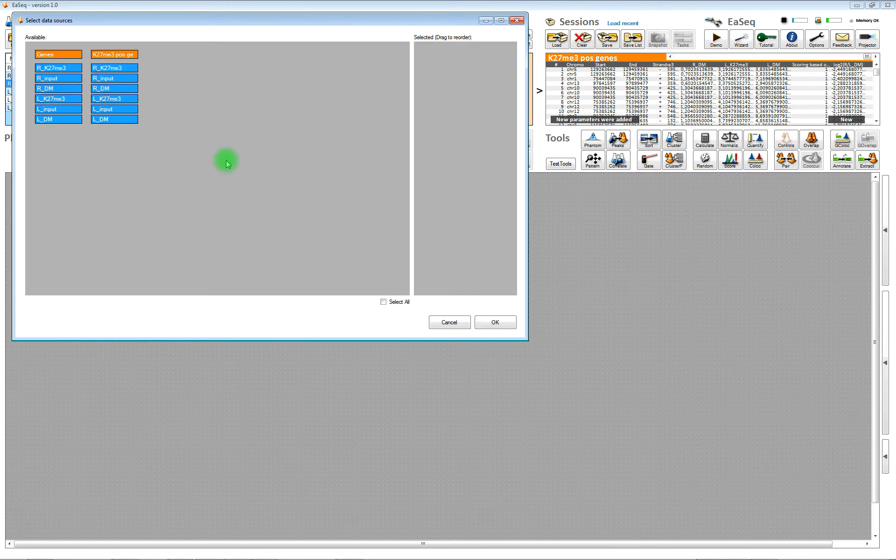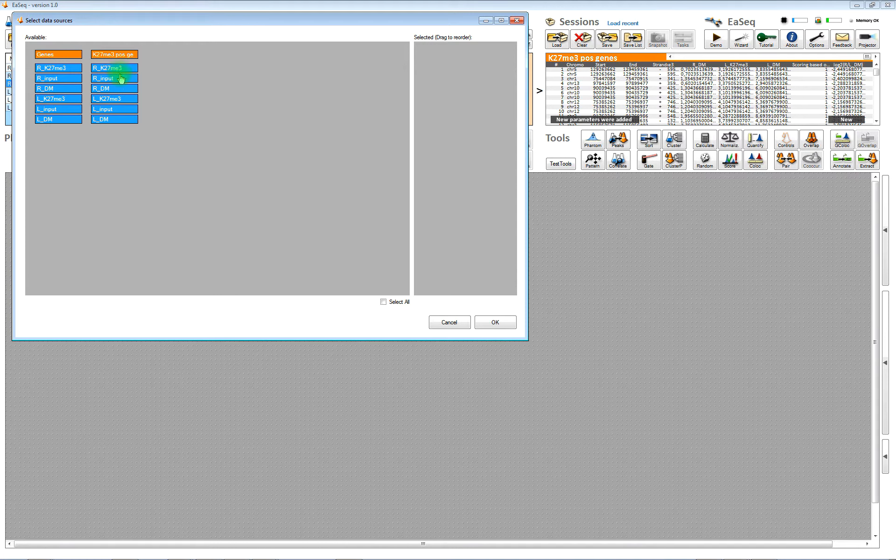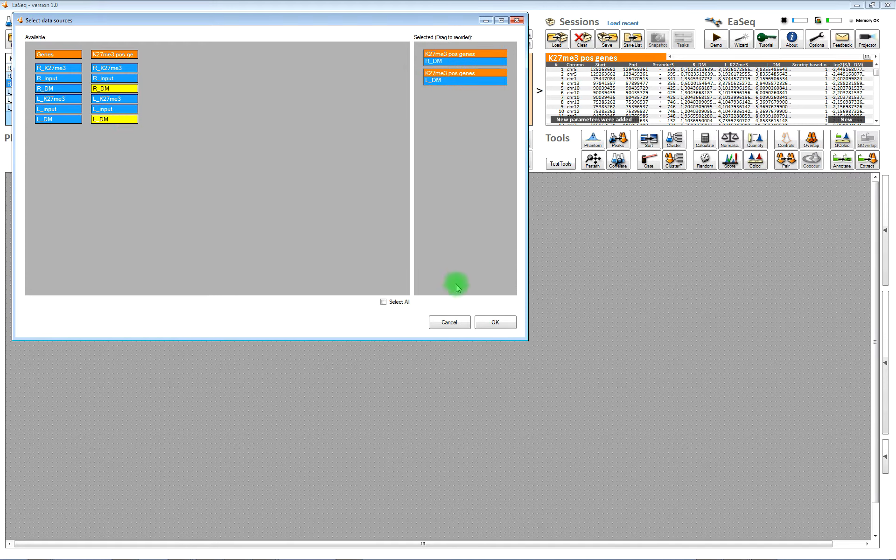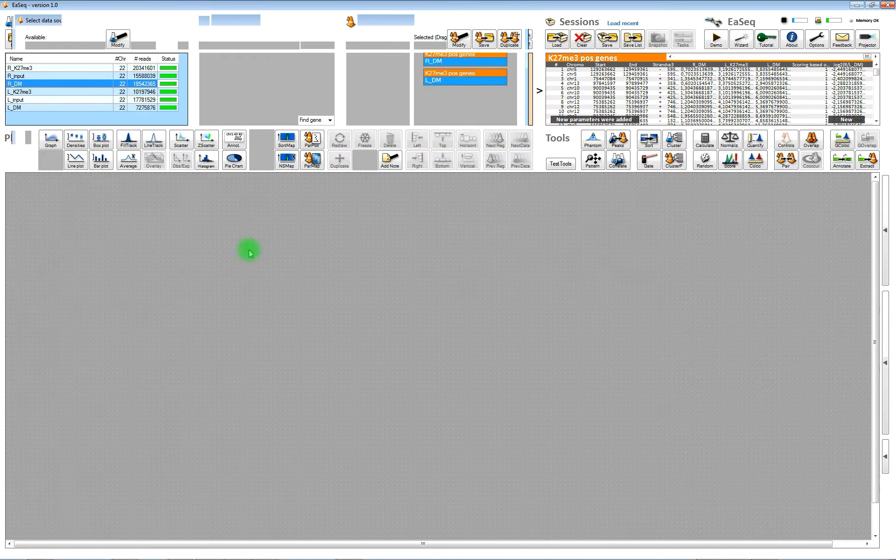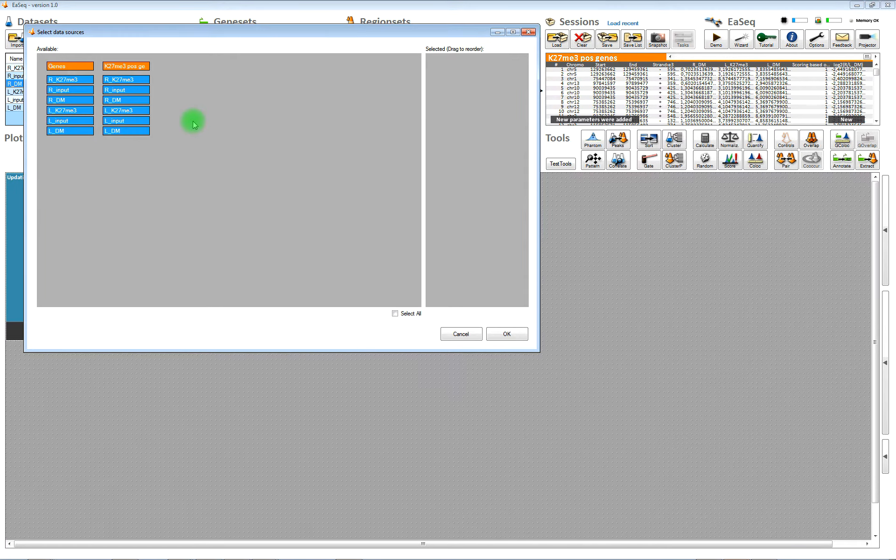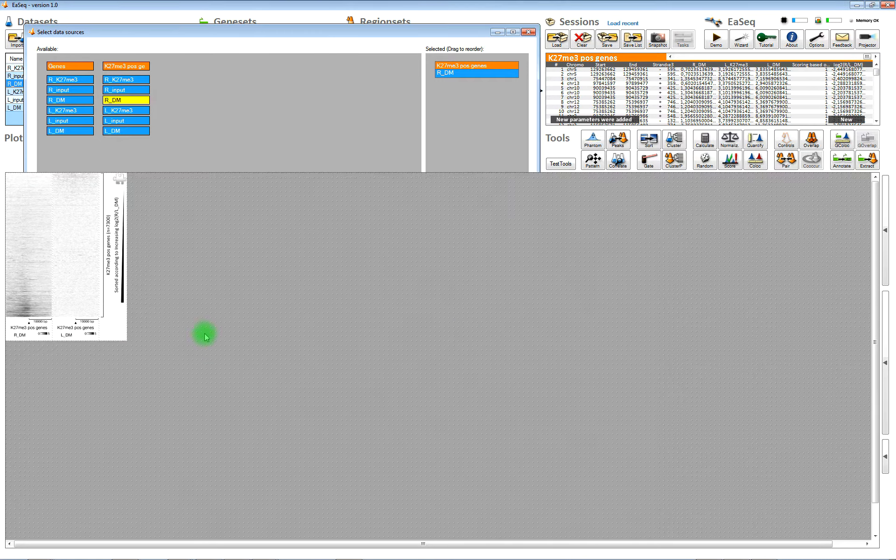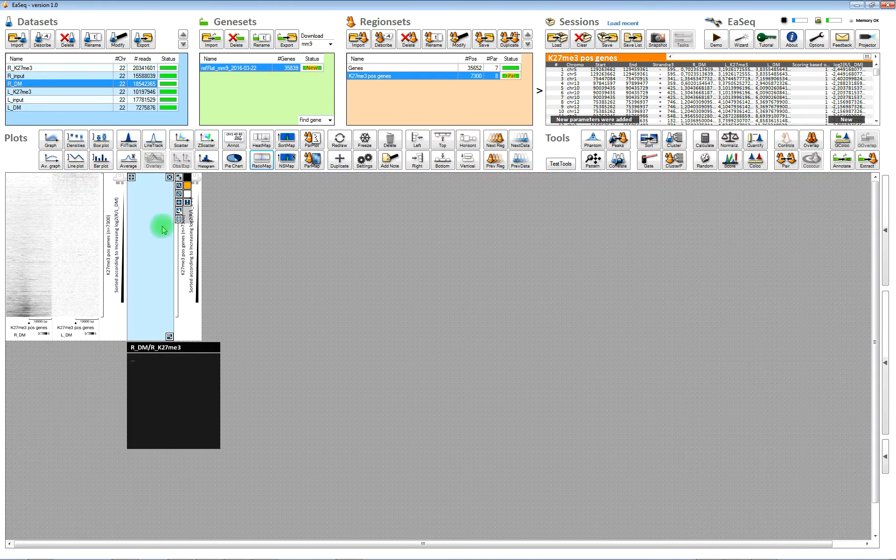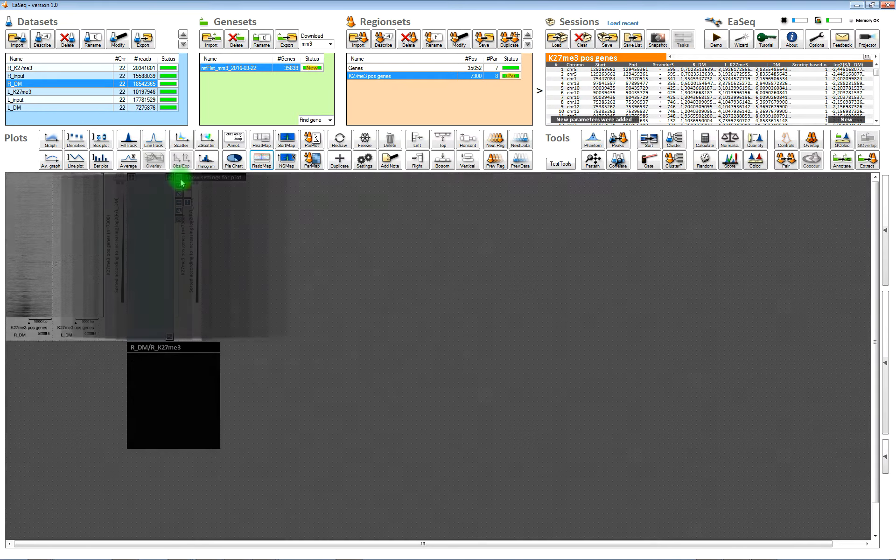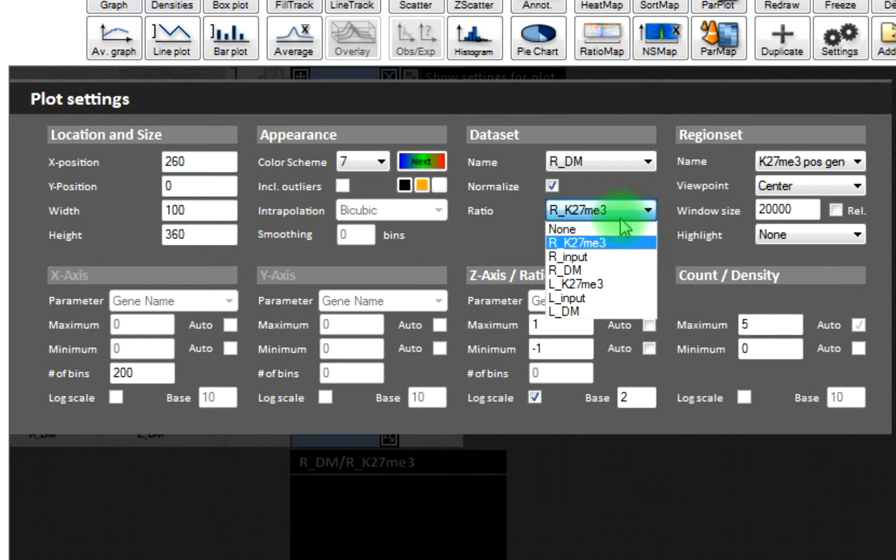Then we will add some heat maps. We will choose to visualize these two double marks, left and right side double mark, and we will also add a ratio metric heat map where you see the level of the right side divided by the level of the left side.